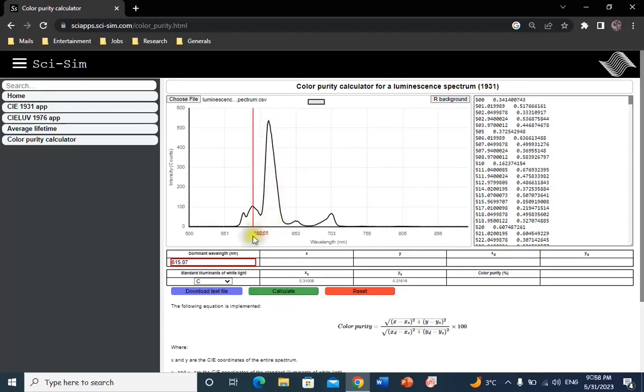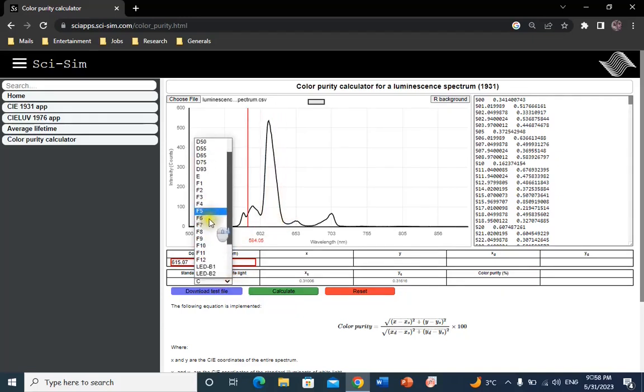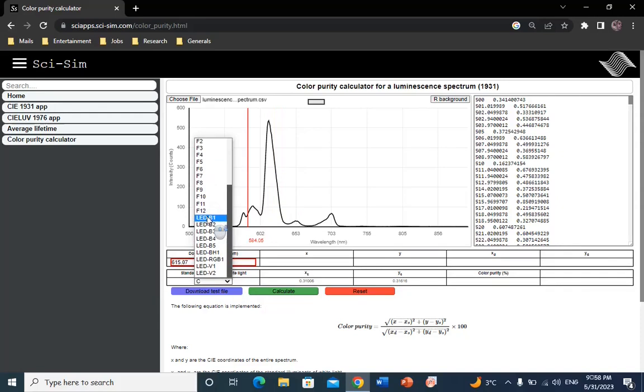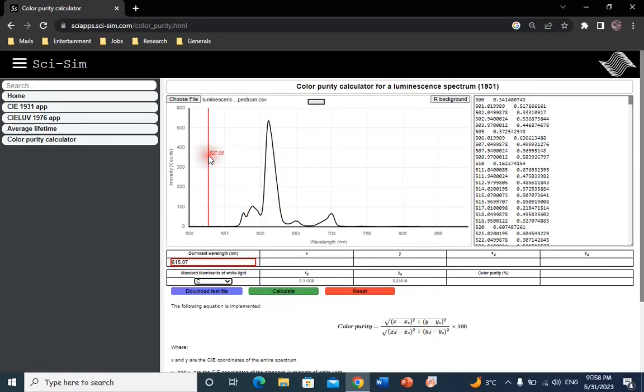Choose the standard illuminant of white light you prefer. You can choose from a wide range of standard illuminants of white light according to CIE 1931 standard.